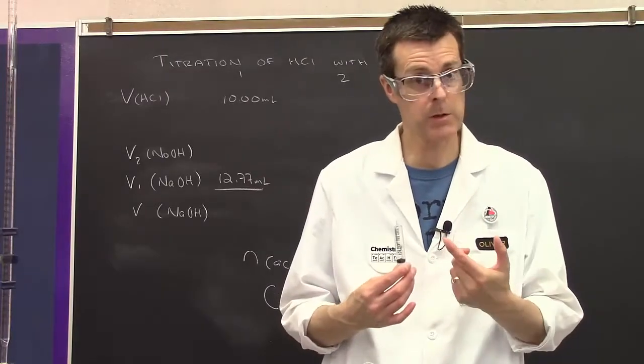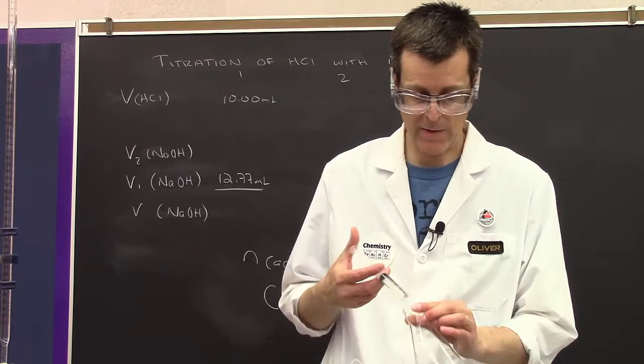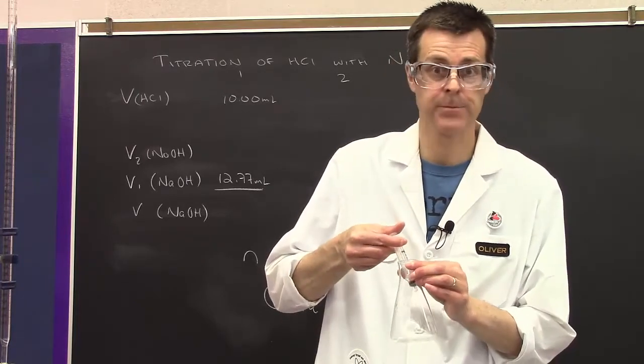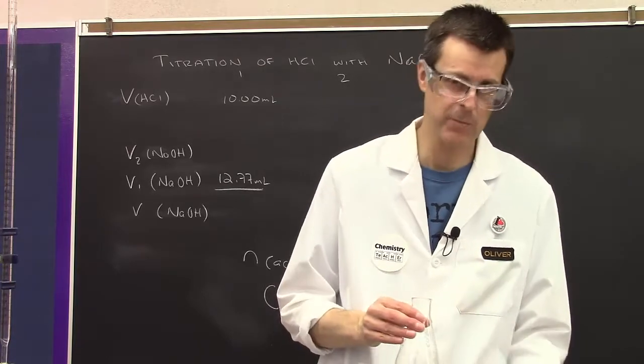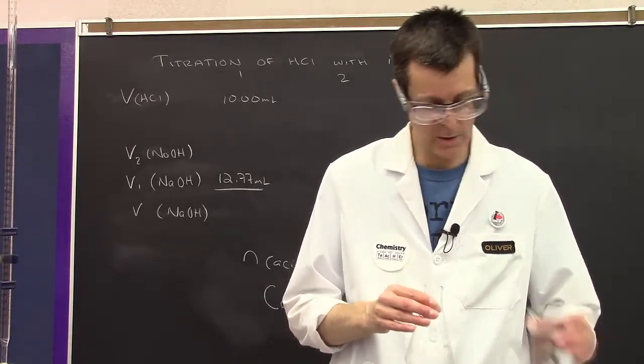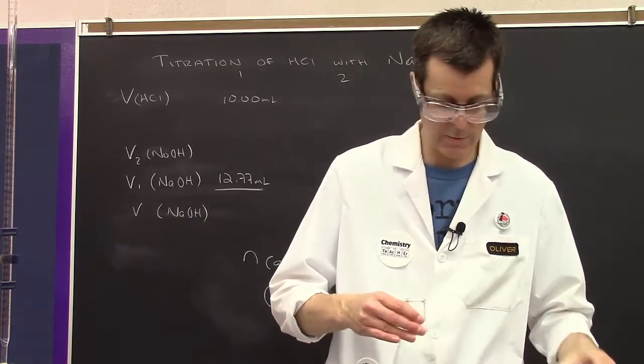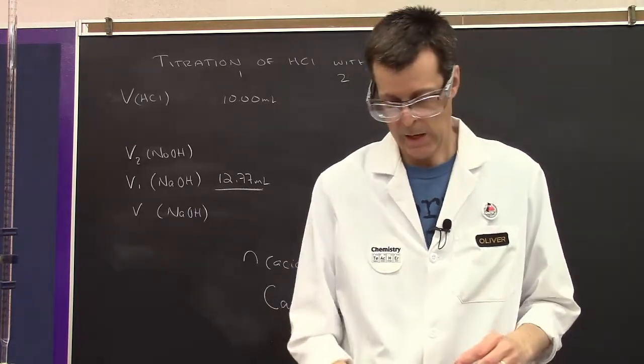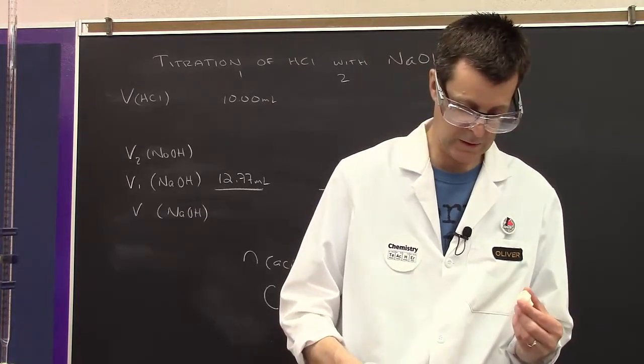I have 10 milliliters of acid in my syringe. I'm going to add that to my flask. Then I'll add some distilled water - the amount isn't really important, it's just there to make sure things mix well. I'm going to add my two drops of phenolphthalein indicator again.